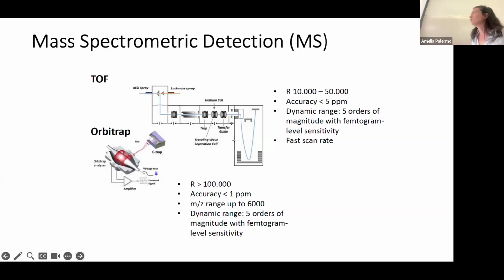There are also, not for QTOF, but for instance, triple quads or even single quadrupoles, like the very old first versions of mass specs. They still work independently from the TOF. The problem is resolution and accuracy, it's an older technology, but it still proves useful to isolate.